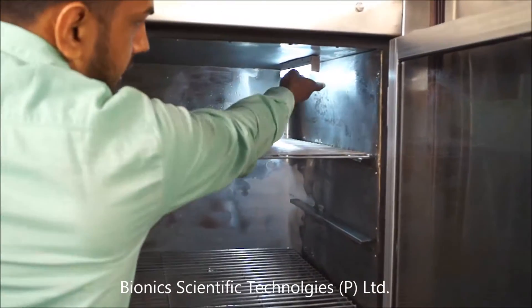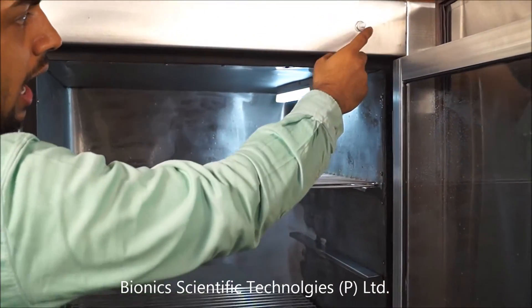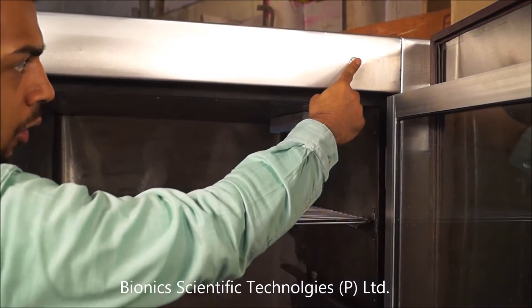There is a light inside this chamber, and it is connected with the door switch.